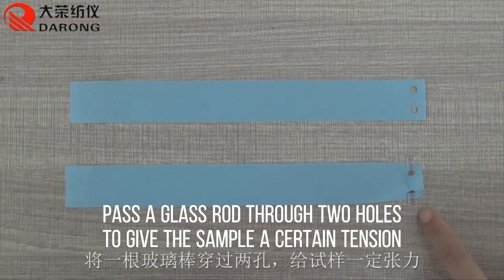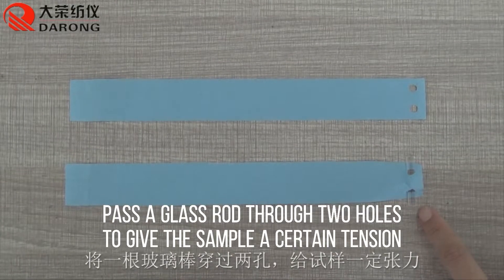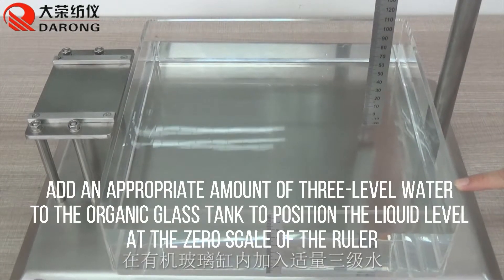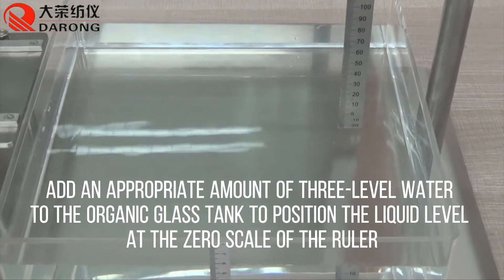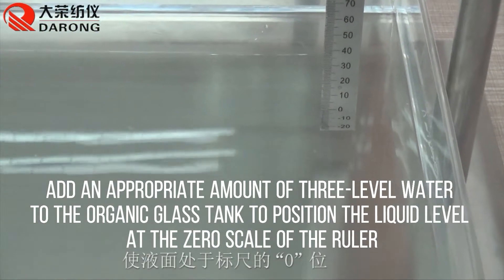Pass a glass rod through the holes to hold the sample and give it a certain tension. Add an appropriate amount of 30°C water to the organic glass tank to position the liquid level at the zero scale of the ruler.